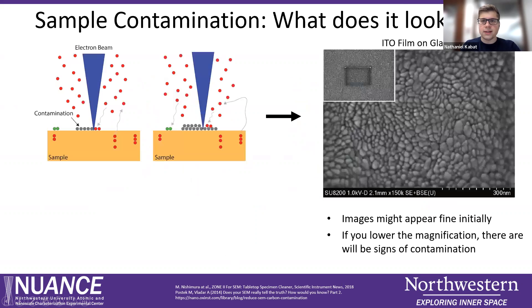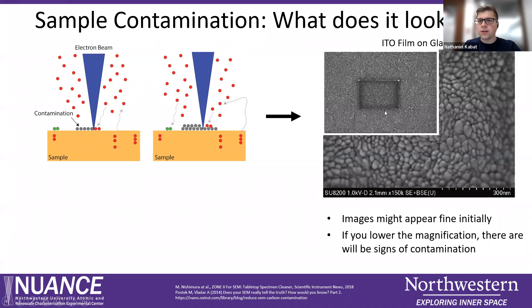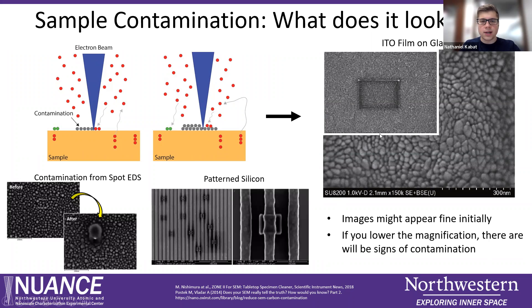These three sources can contribute to sample contamination when you are scanning the electron beam in an SEM. As the beam rasters across the sample, these three factors all contribute to this buildup of a contamination layer where you are scanning. You can see this sort of gray layer that builds up the longer you scan. If you have a dirtier sample versus a cleaner sample, this can be a lot worse. So if you have a dirtier sample versus a cleaner sample, this can be a lot worse, and that's how you get this layer in the SEM.